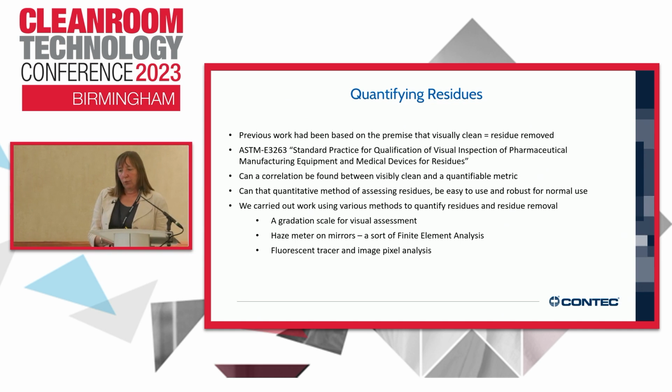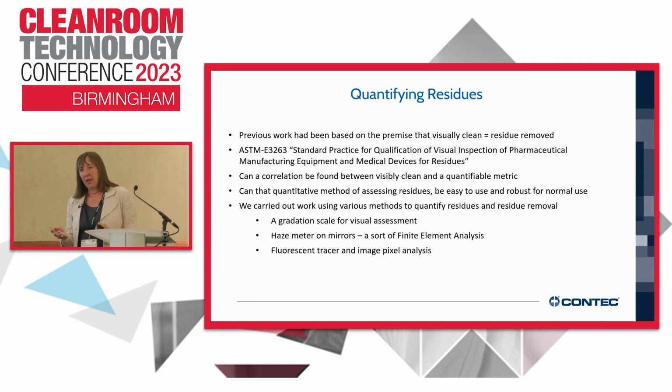So we thought we would do a little bit of work, trying to put a scale in for visual assessment, looking to see if haze meters might help, and a fluorescent tracer and pixel analysis. So that's where we add a set amount of fluorescent tracer into the disinfectant and apply it to a surface, and then we can see what's going on.